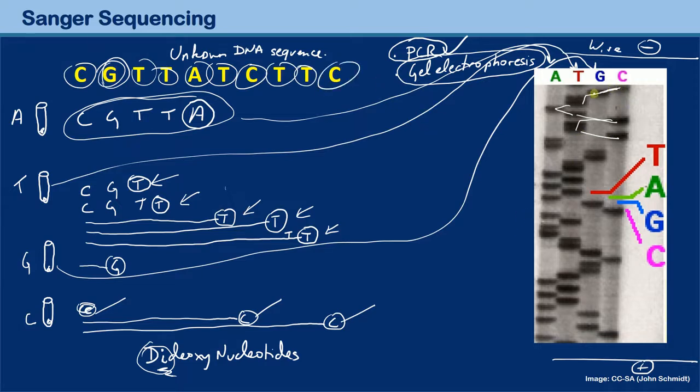So what I do is I'm simply reading off the whole thing in the correct sequence, and then I have my DNA sequence, okay? And of course I didn't know at the beginning, when I did my PCR, the lengths of the DNA fragments, but I now know them.